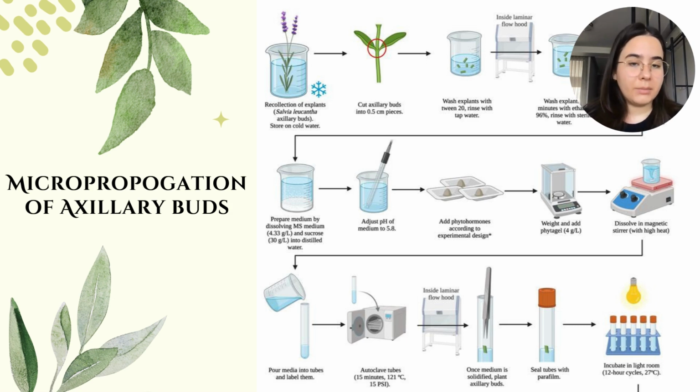So for our experimental design, what we did was axillary bud morphogenesis, as I said before. We took the axillary bud of the plant and planted it in MS media. And we played a little bit with concentrations of phytoregulators or growth hormones.